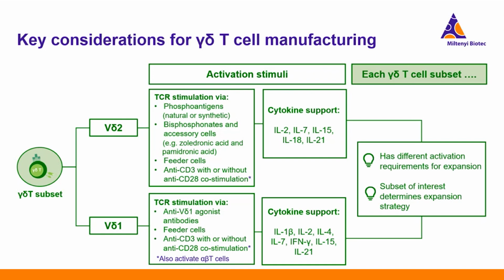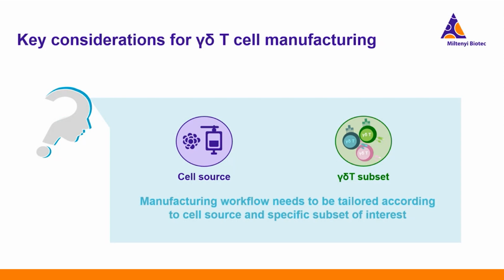Therefore, each gamma delta T cell subset has different requirements for activation, and this is then influencing and determining the expansion strategy that we need to establish. Therefore, the manufacturing workflow needs to be tailored according to the cell source and the specific subset of interest.